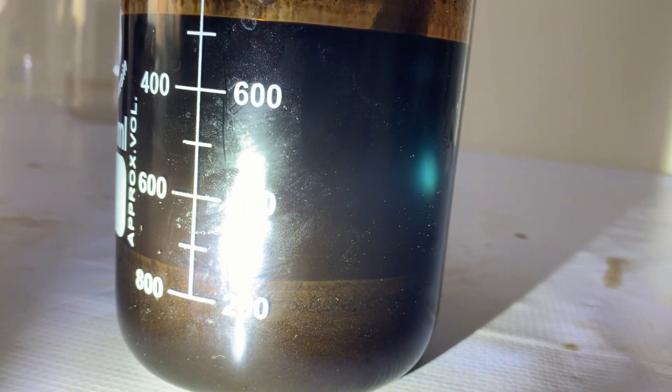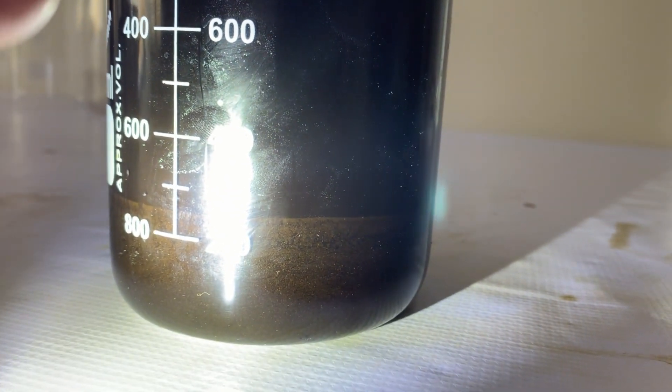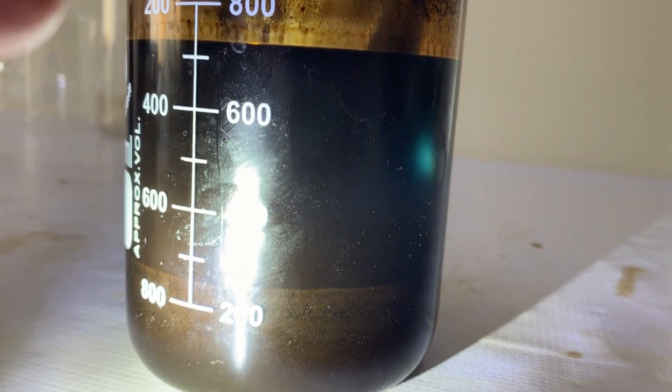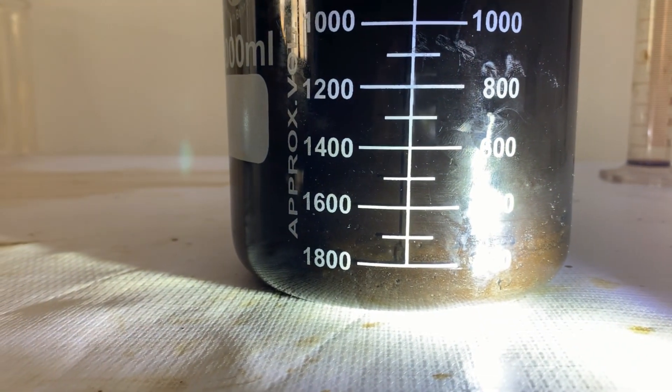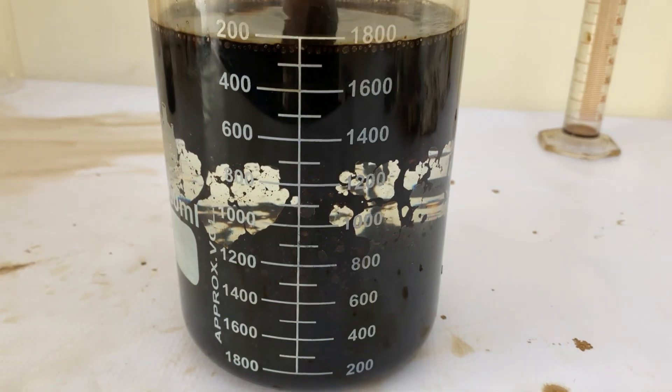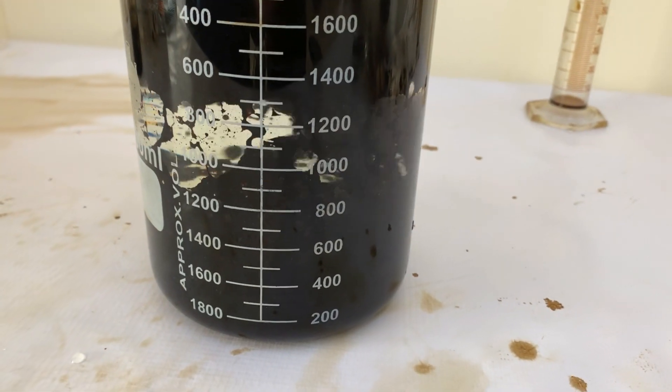The next day we find two phases in our beaker: crude oil and already very clean looking sand. Now we add 25 degrees C warm water and give the whole mixture a good stir.